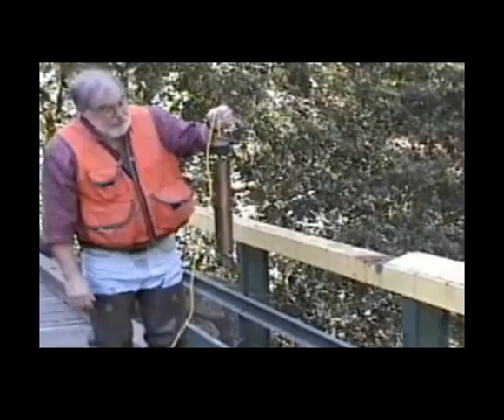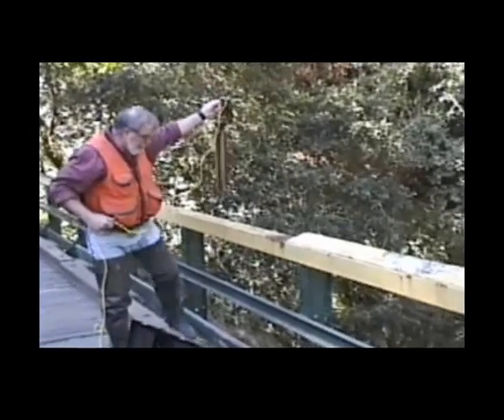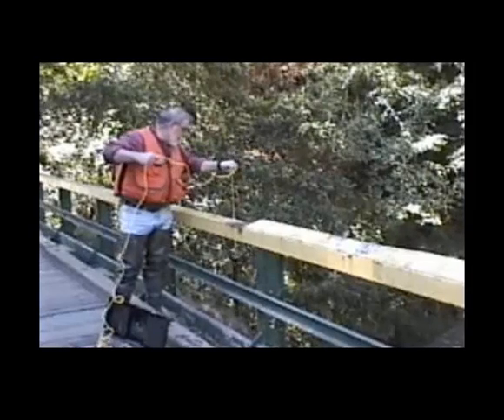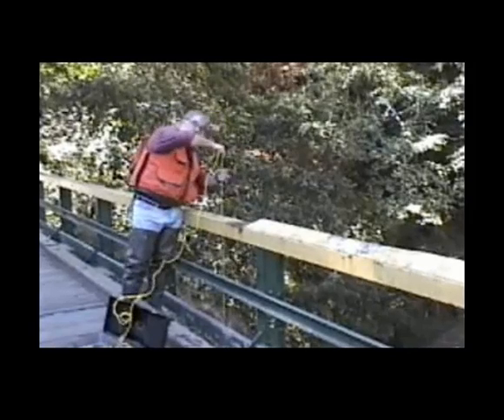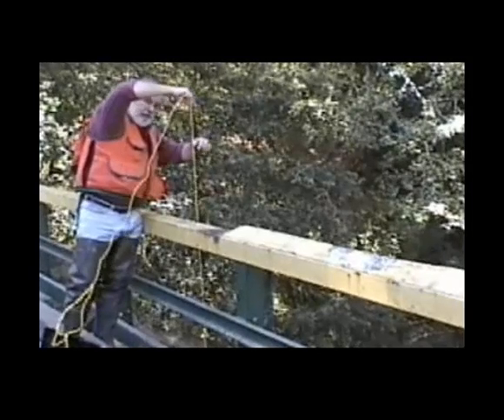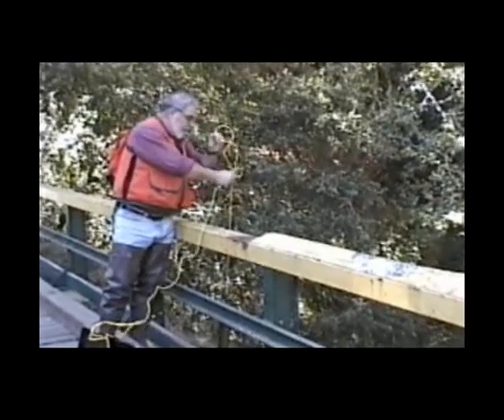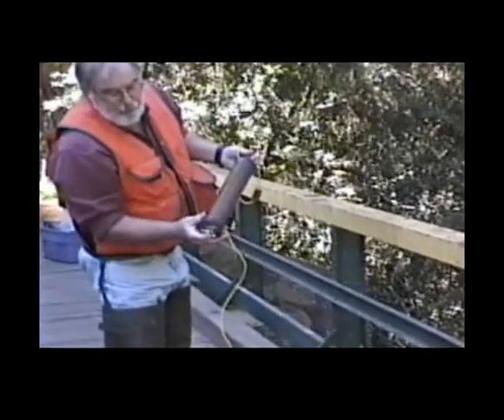Now we will lower the sampler off the side of the bridge, or if you're in a boat, off the side of your boat, down to the proper depth, indicated by markers on the line. When we reach the desired depth, the messenger, the brass weight, is released, sliding down the line and locking, closing the sampler. The sampler is then retrieved and the water is decanted using a spring-loaded valve in this fashion.